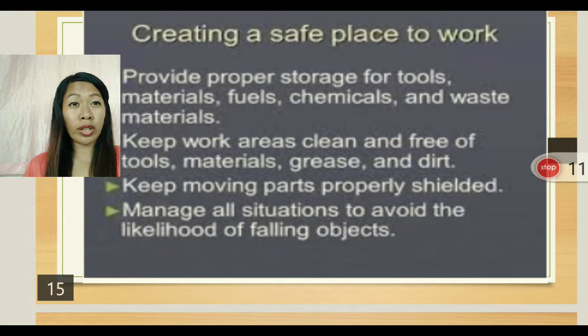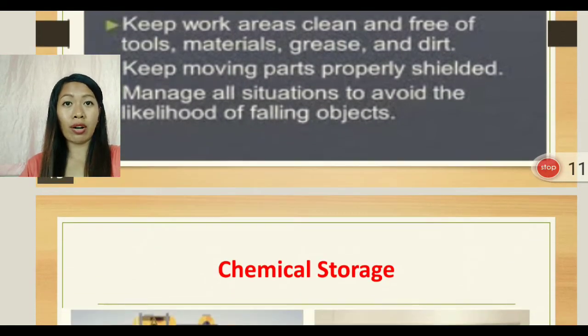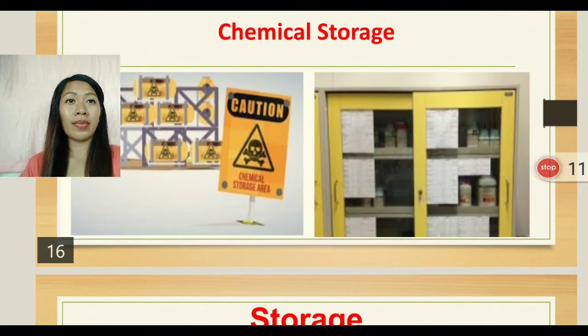We have to keep work areas clean and free of tools, materials, grease, and dirt. Keep moving parts properly shielded and manage all situations to avoid the likelihood of falling objects. So again, it boils down to safety and for protection of personnel and as well as the equipment.